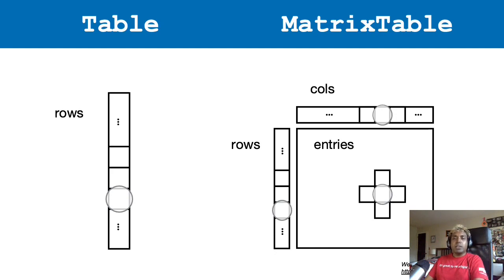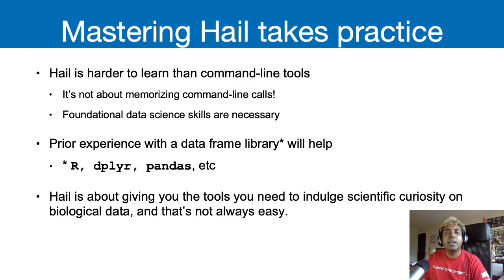and how you would join your own annotations and not just VEP into your matrix table. We also have pretty cool cheat sheets that John came up with, which is on this website. It's very clickable when you have the slide deck. And it's one of my favorite things to show people because it also shows you quick and easy commands in order to slice and dice your data easily. So mastering Hail takes a lot of practice.